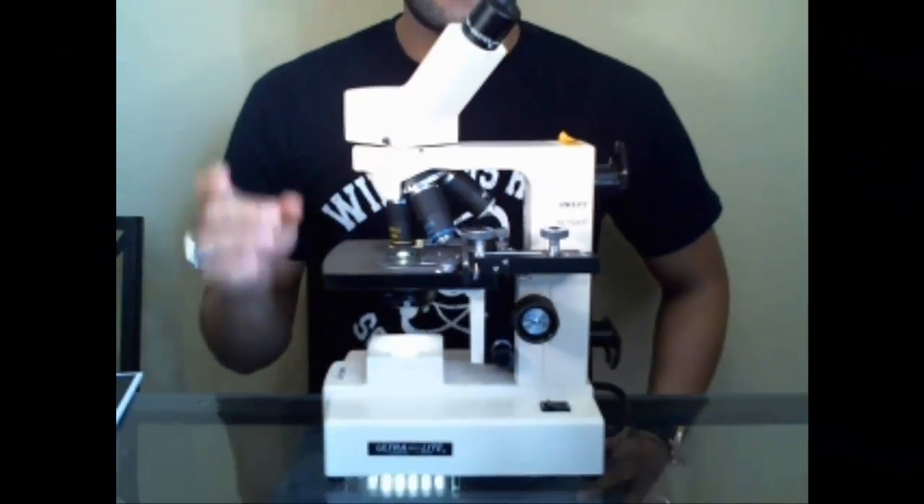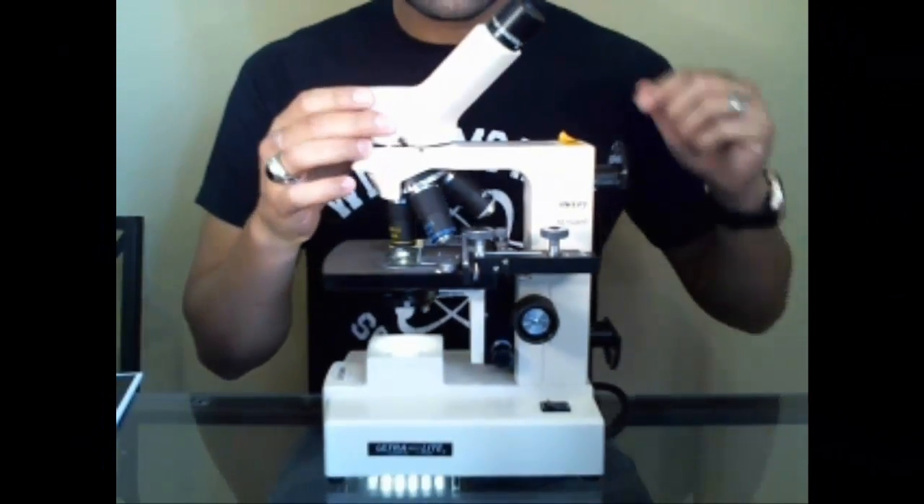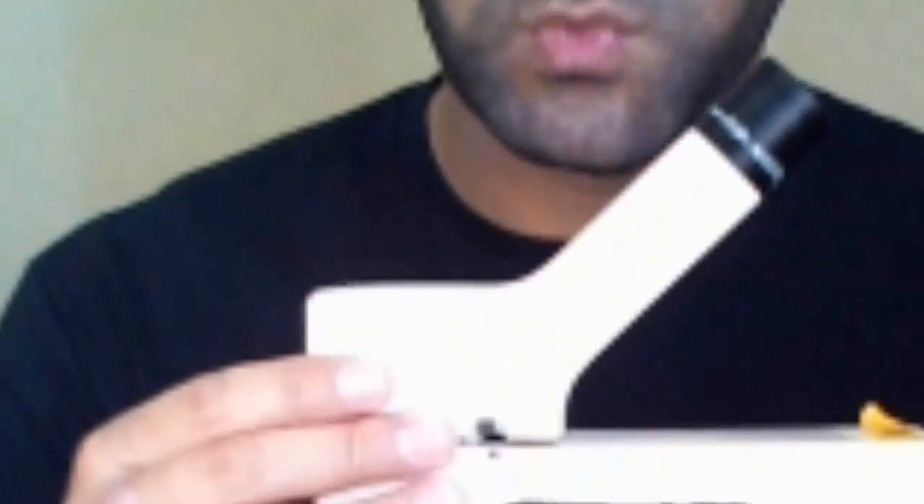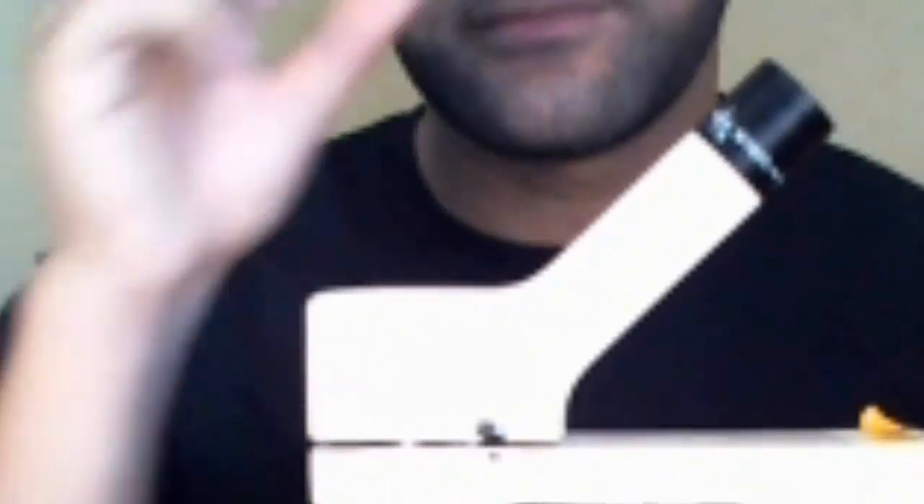Now let's talk about how to actually focus and how these lenses work together. There are multiple lenses to work with — this area gives you the variety of objective lenses. There are three typical objective lenses on a compound microscope. The brand shown here has a yellow, followed by a blue, and a white. Other microscopes may have red, then yellow, then blue. For biology, we mostly care about the yellow and blue objectives.